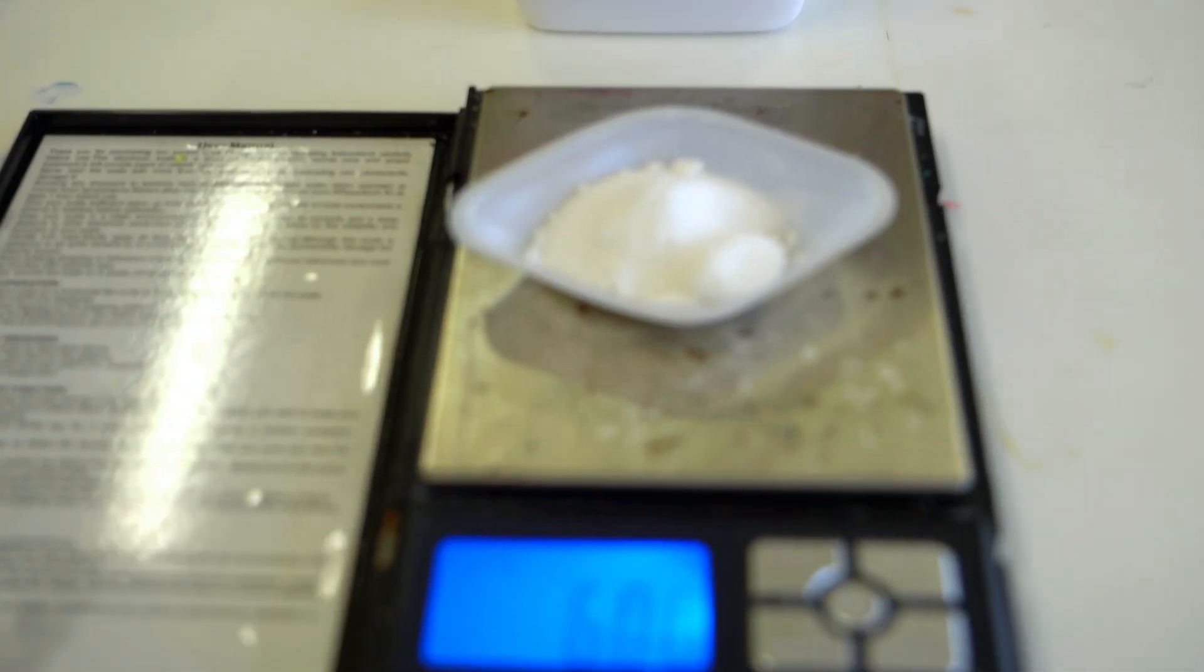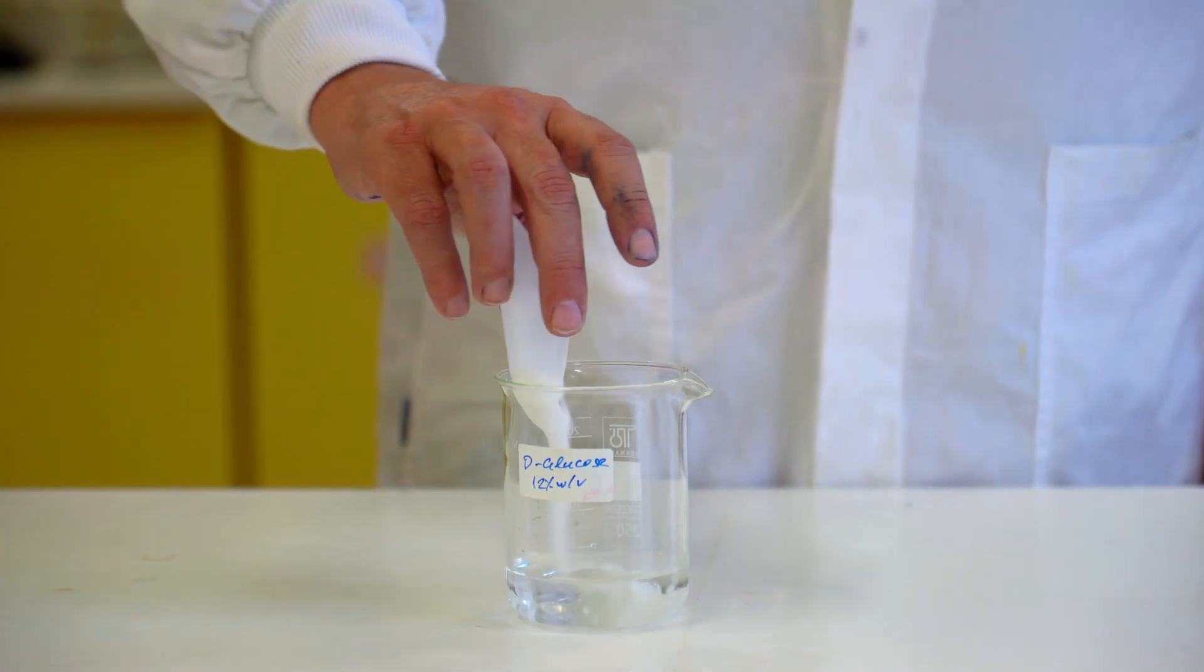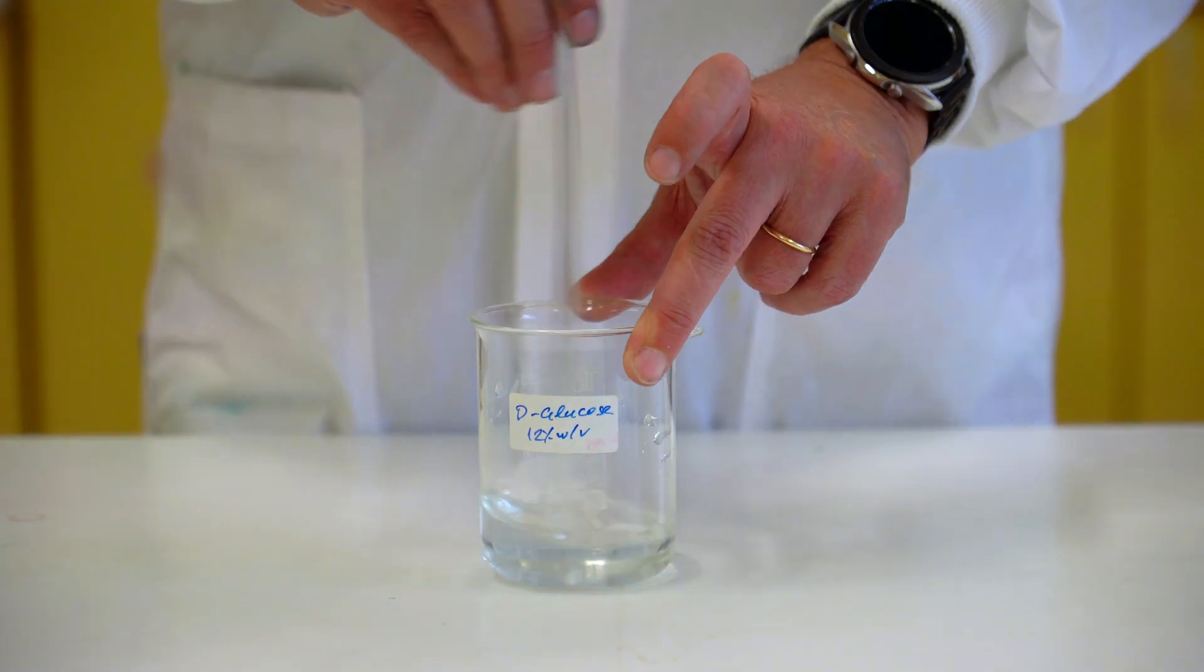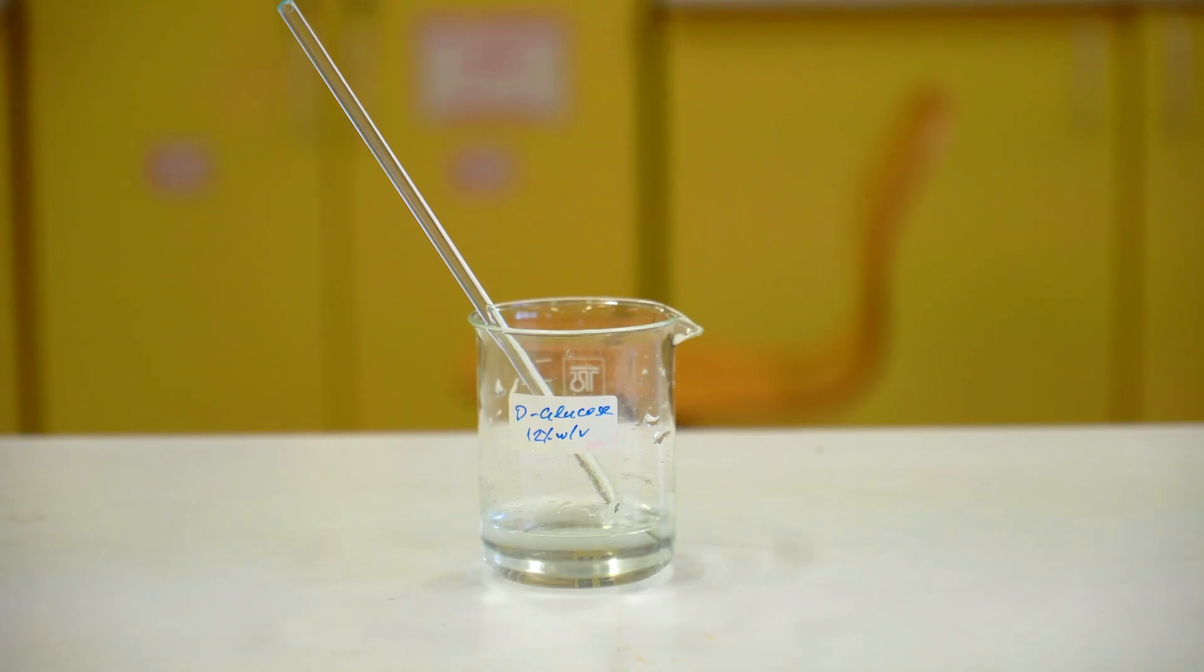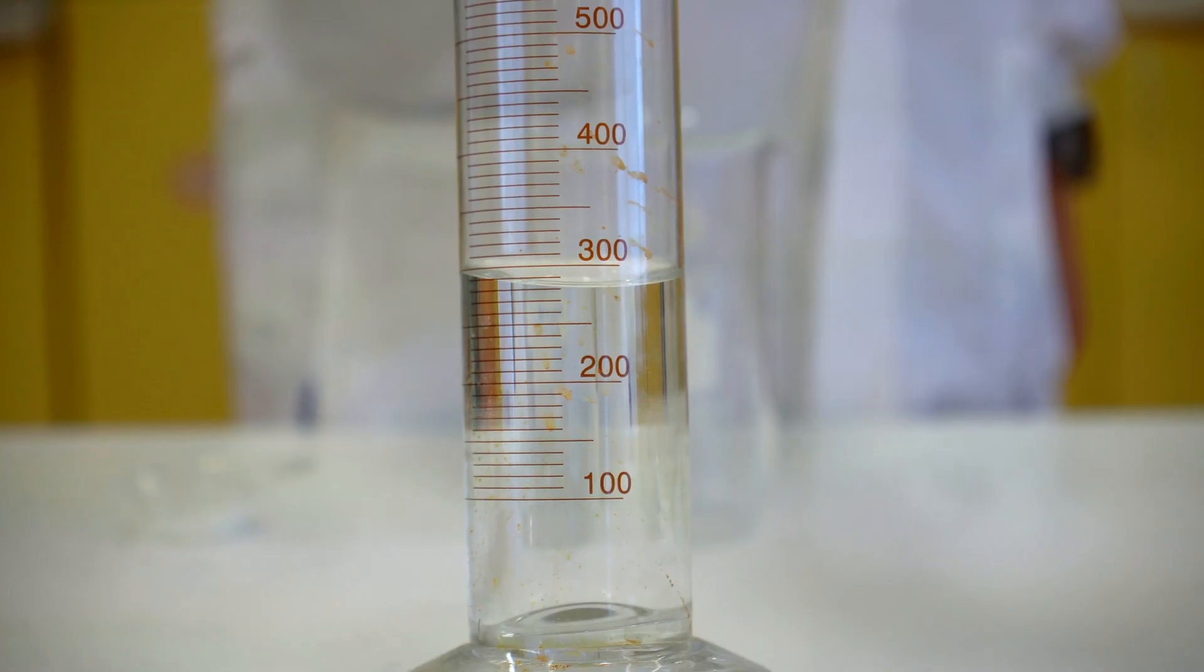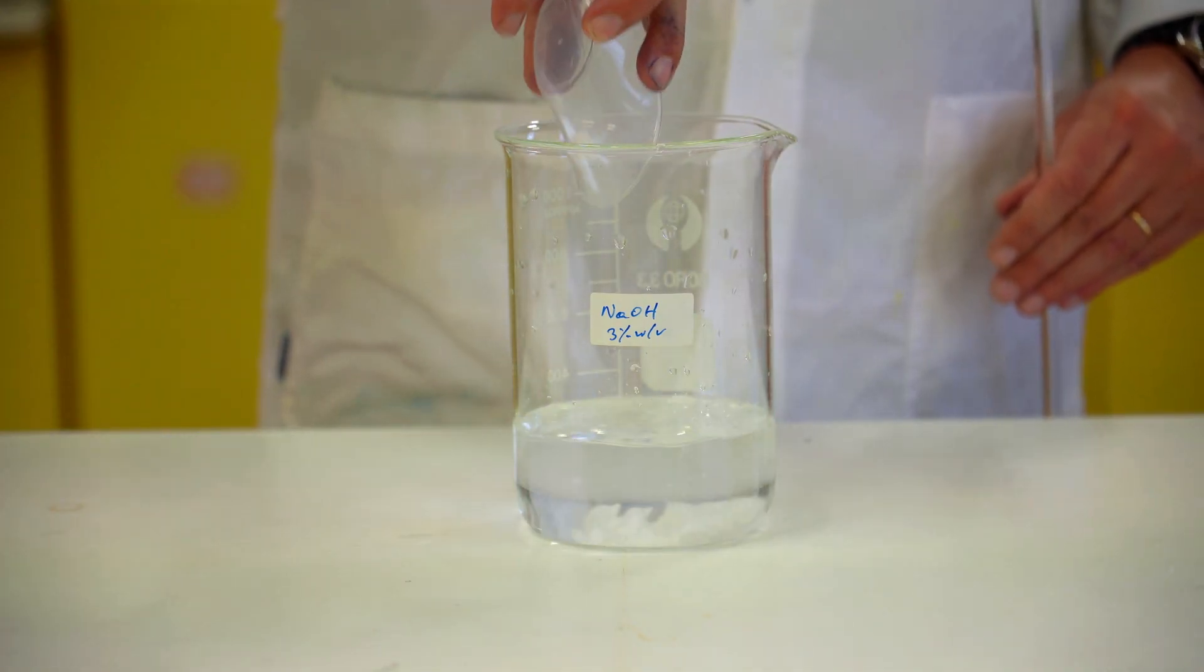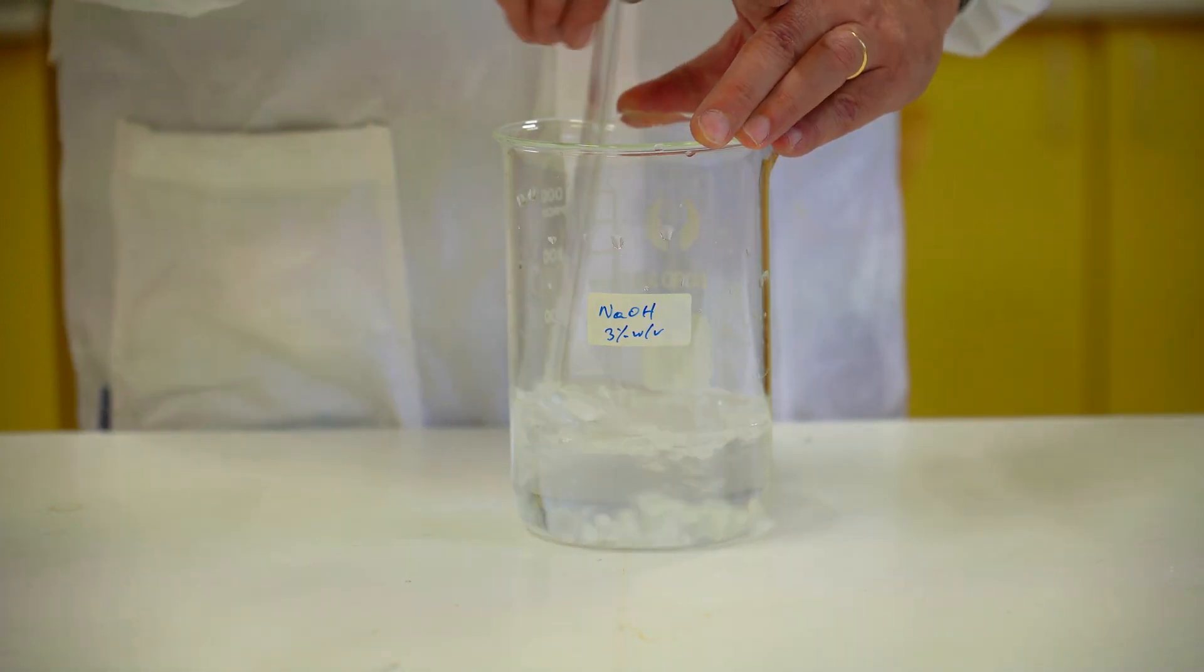Then we prepare a 12% weight per volume glucose solution. Glucose is a reducing agent that favors conversion of indigo carmine to its reduced yellow form. This reaction takes place in alkaline conditions. Therefore, we prepare a 3% sodium hydroxide solution.